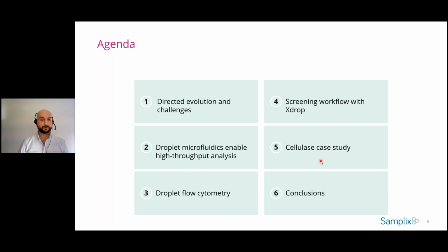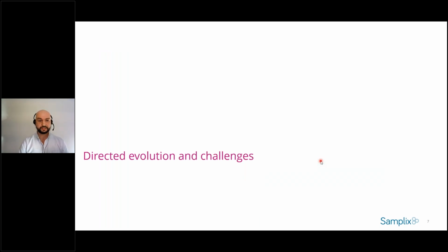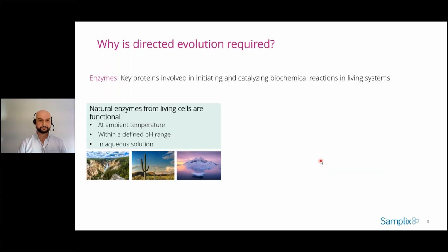Afterwards, we will focus more on the screening workflow with the Xdrop, and after that, we will delve into a cellulase case study that was in collaboration with my former research group. And in the end, I will give a short conclusion. So let's start with directed evolution.